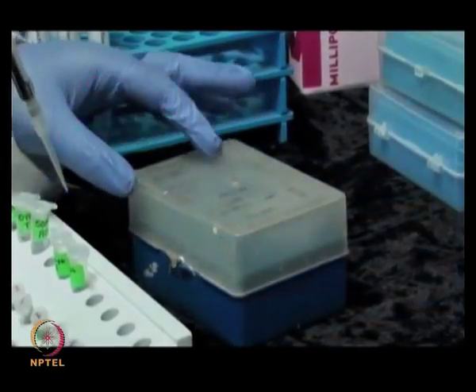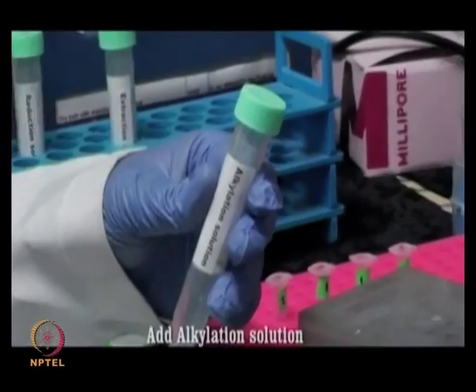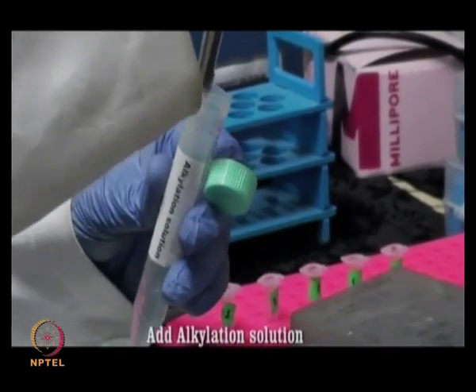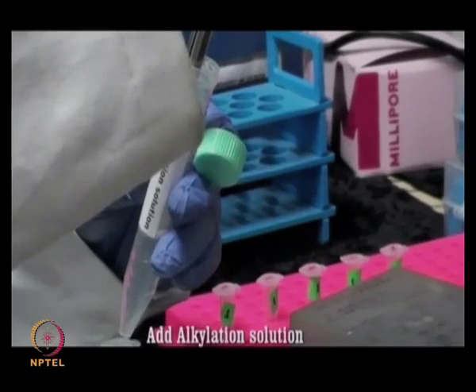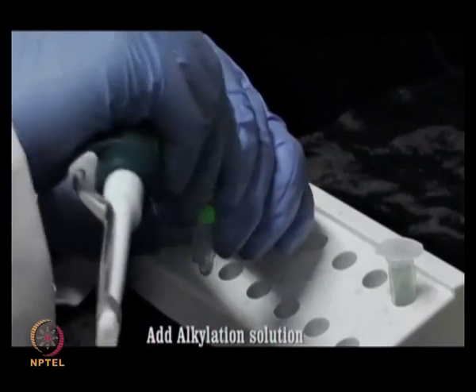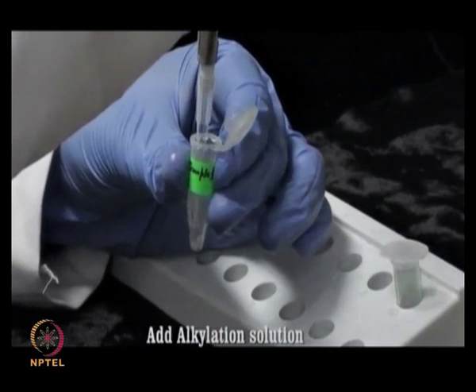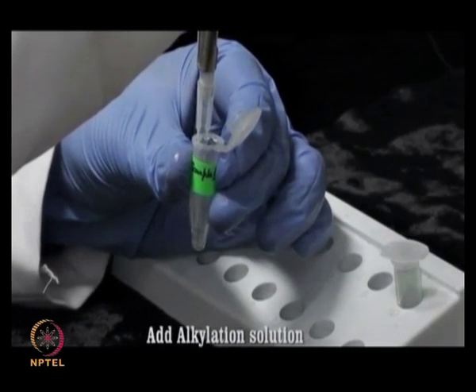Then add alkylation solution. So, add 30 to 50 microliters of alkylation solution and incubate it for 20 minutes at room temperature in dark condition.